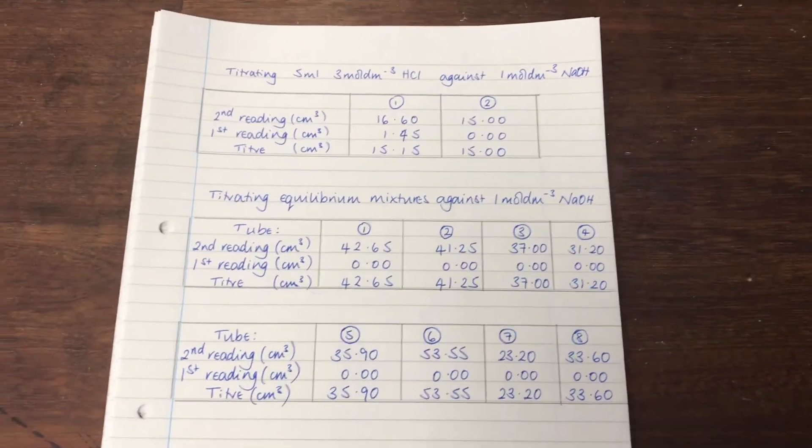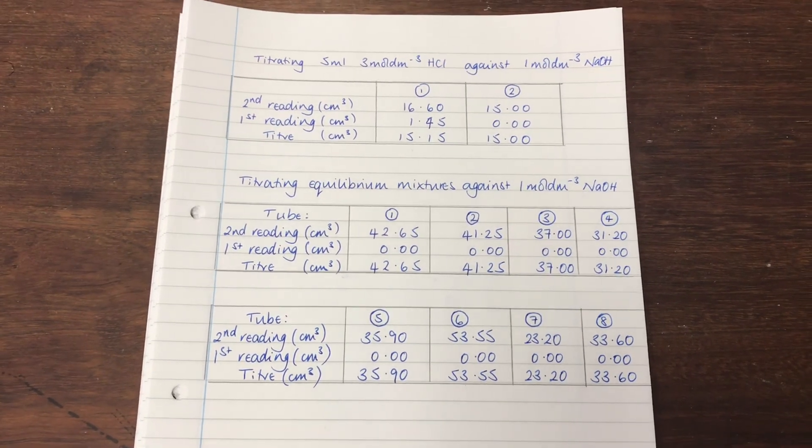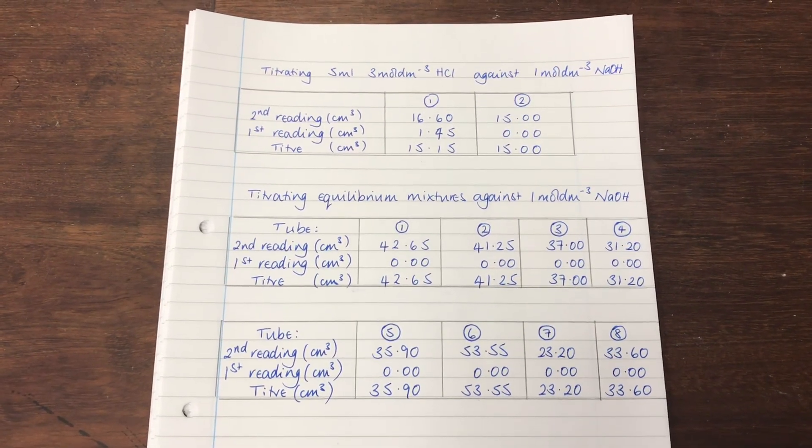I've recorded all the data here. I'm going to take a photograph of this and put it in the class notebook so you should be able to access that really easily.